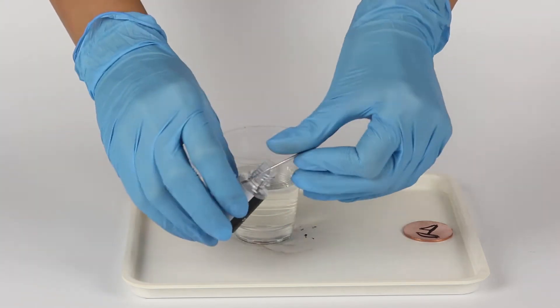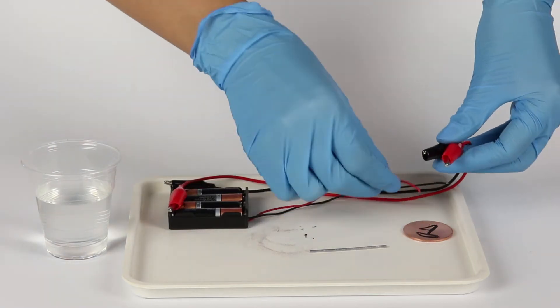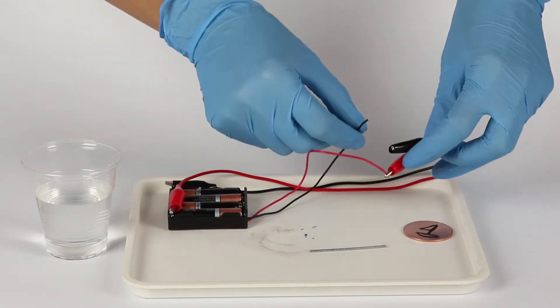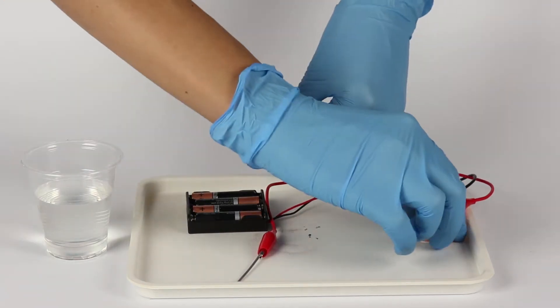Prepare the zinc rod. Take the battery holder with the batteries, and using the crocodile clip wires of the corresponding colors, connect the zinc rod with the red wire, and the copper disc with the black wire.